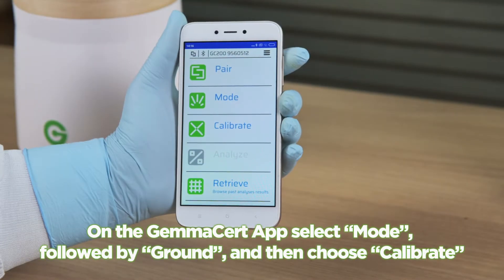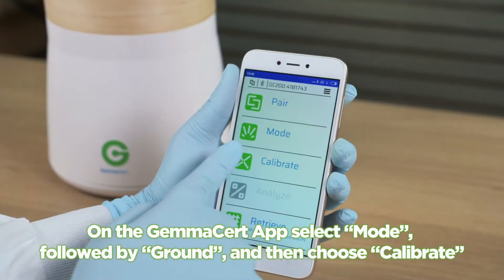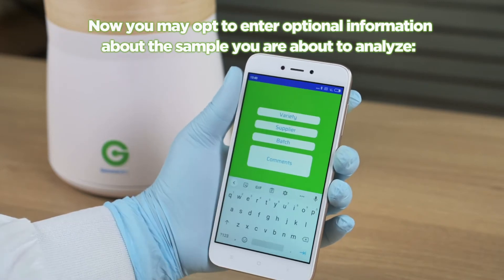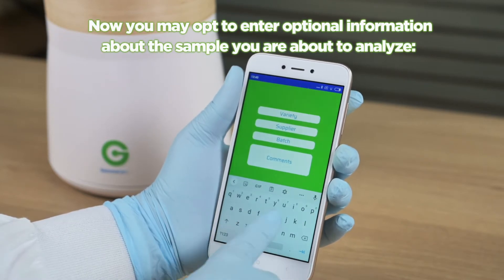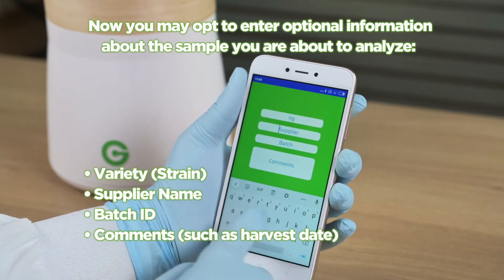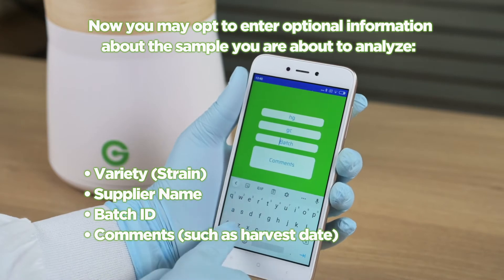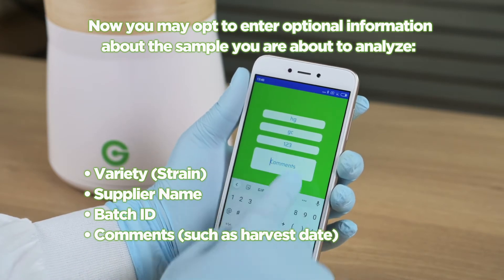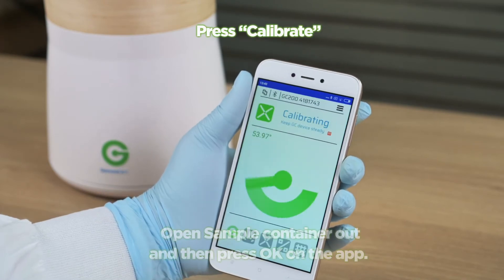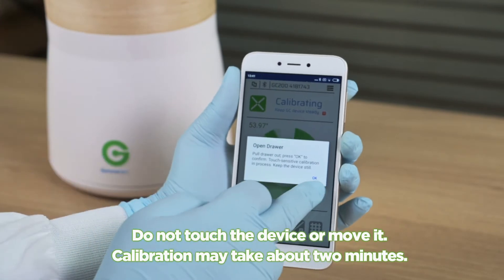Drive the sample container inwards gently using the green handle. On the GemAssert app, select Mode, followed by Ground, and then choose Calibrate. You may opt to enter optional information about the sample you are about to analyze: variety, strain, supplier name, batch ID, and comments such as harvest date. Press Calibrate.